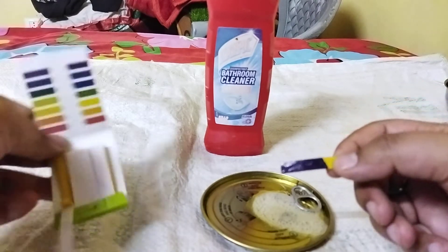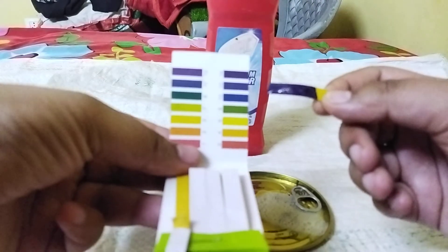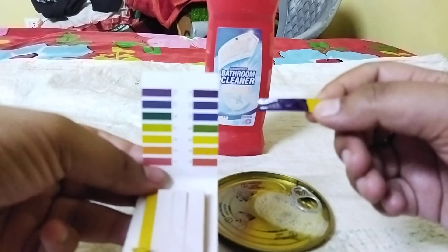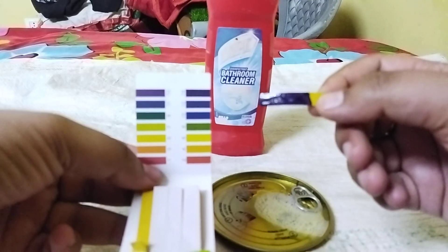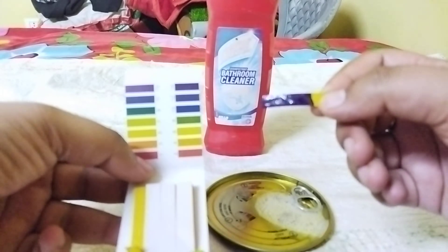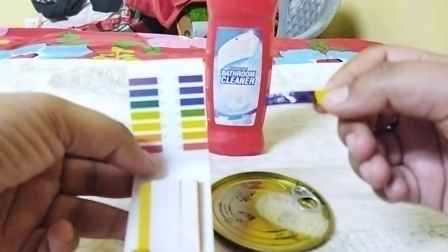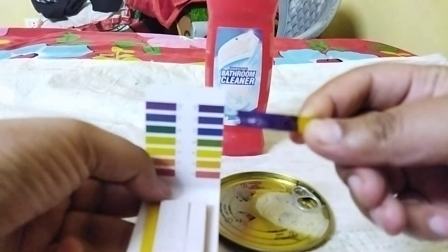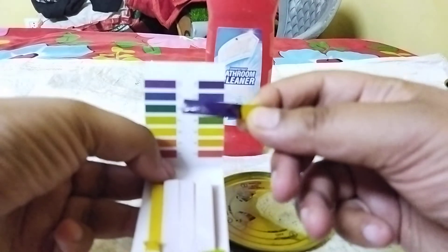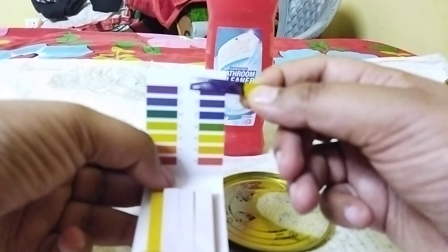Here we go — dipping it into the Harpic. You can see the instant result; I wasn't expecting such an instant result. We can clearly see it is too much basic in nature. One thing to keep in mind when you're using Harpic or some other kind of cleaner — make sure you're not consuming it, swallowing it, or exposing yourself to it in any other way. I can see the pH is somewhere between 13 and 14, so it is way too basic in nature.